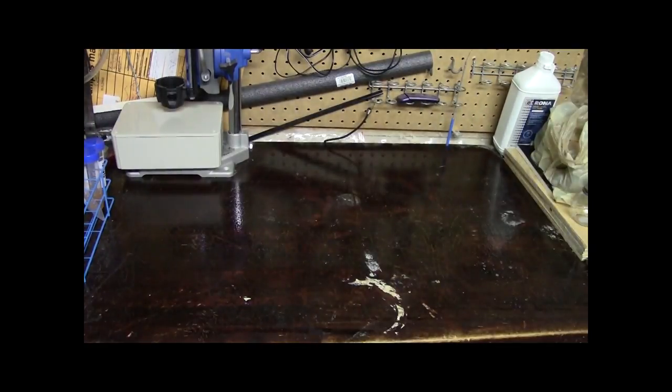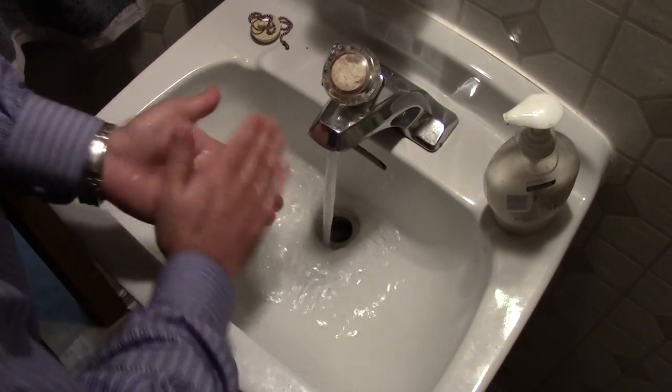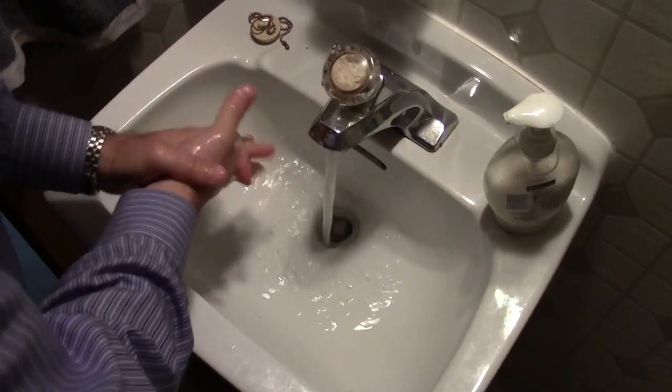While that sanitizing agent is working, you next need to get yourself prepared — and what I mean by that is you need to make sure you are clean at the same time. What you really want to focus on, of course, is washing your hands.